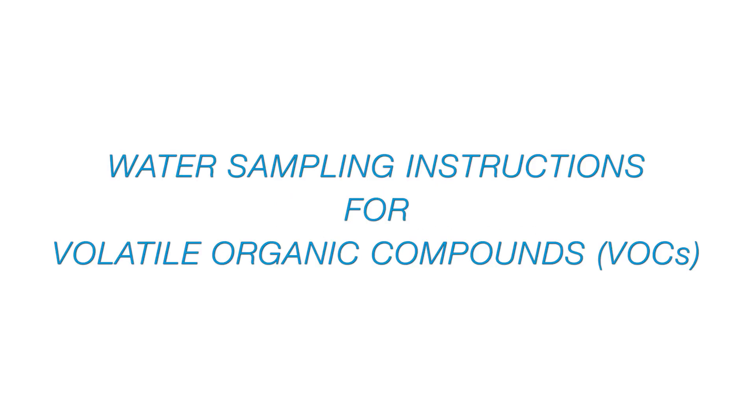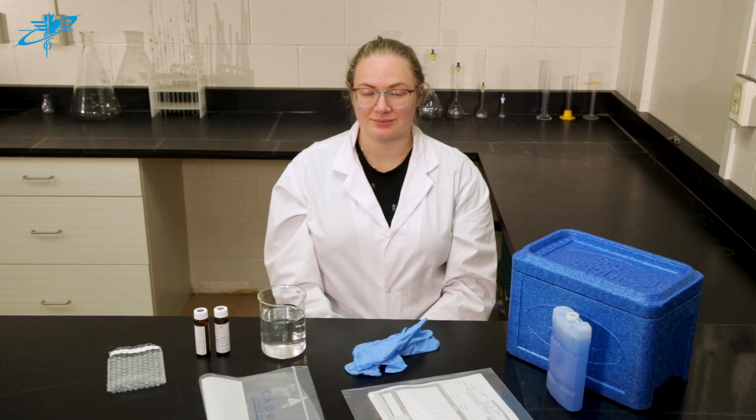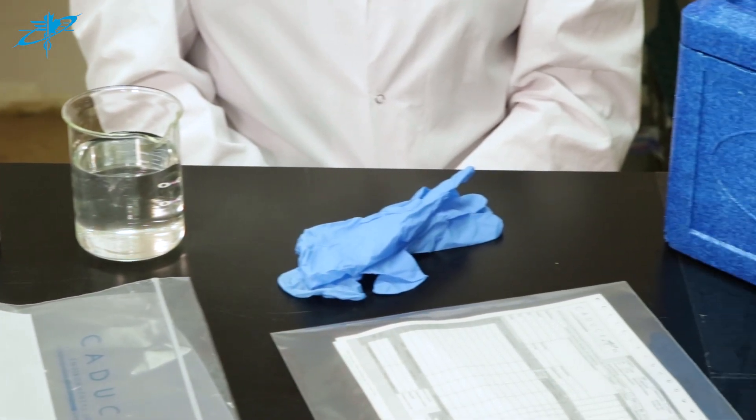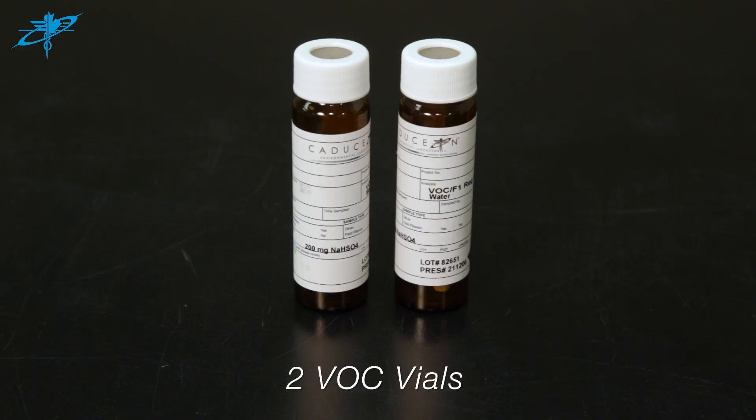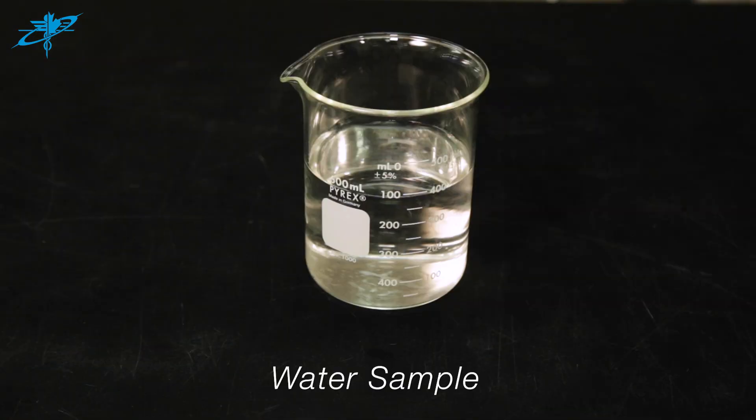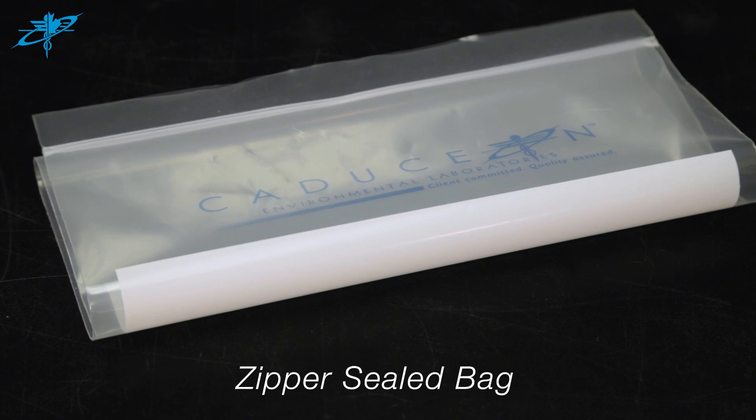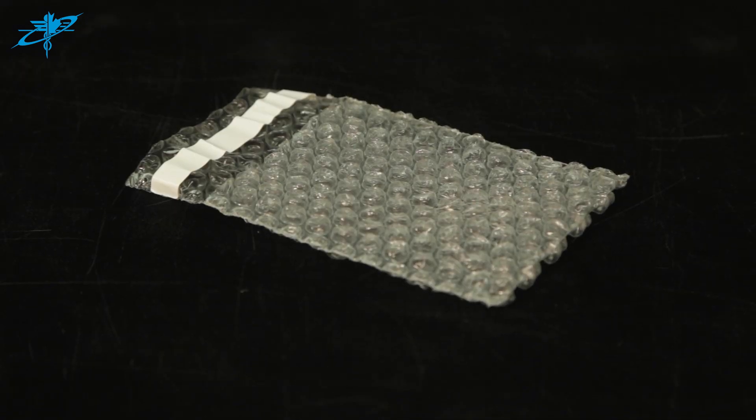This video contains water sampling instructions for volatile organic compounds. Prepare your samples in a clean, dry area free of contaminants. Here are the items you will need: two VOC vials, water sample, zipper-sealed bag, bubble wrap bag, hard shell cooler, ice packs, and a chain of custody submission form.